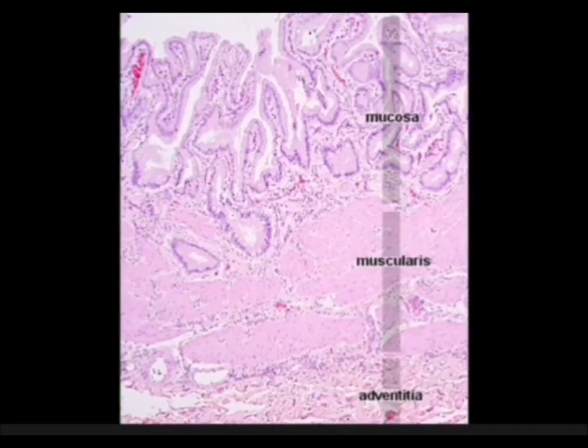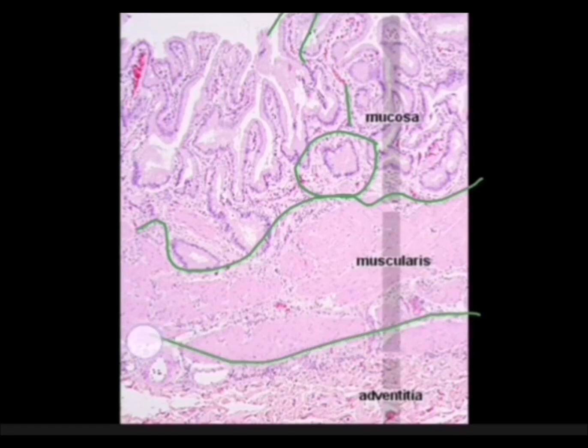This is another slide picture, and you can clearly see that up to this mark we do have a mucosa, and the mucosa will include the simple columnar epithelium. Then we have the lamina propria having blood vessels, nerves, and lymphatics, and then these are the crypts, okay, also in a pathological condition known as Rokitansky-Aschoff sinuses. Then we have the fibromuscular coat up till here, and then we do have the adventitia at the end. So there's no submucosa, right? So now you know the points.